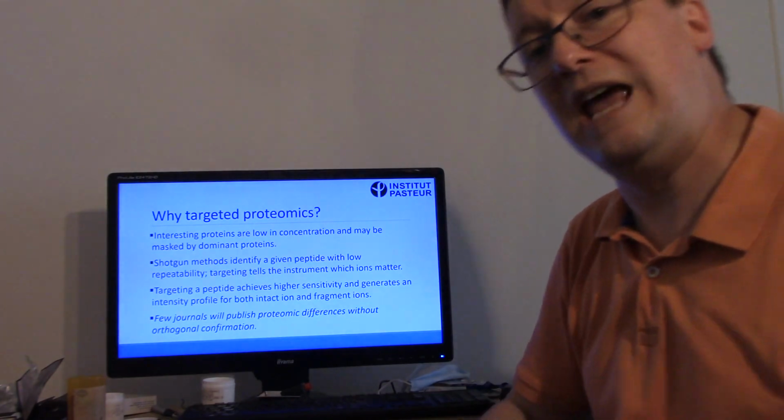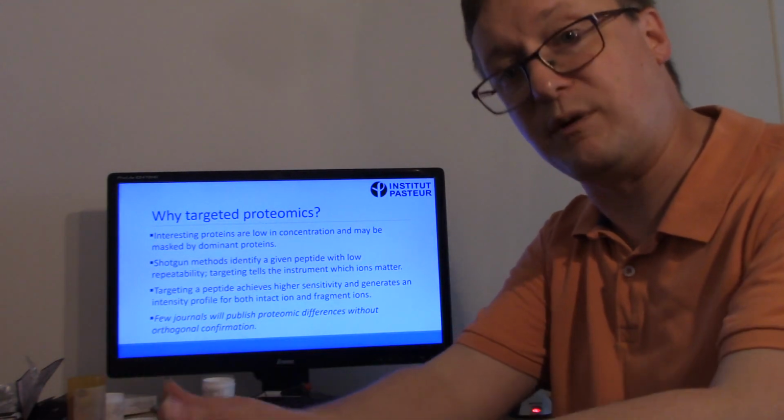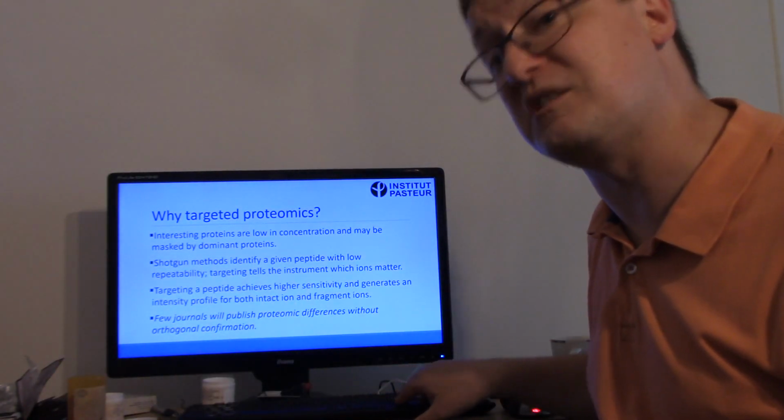So these days, having an orthogonal experiment, such as a targeted proteomics experiment to go along with your shotgun, is much more likely to get you something that's publishable.